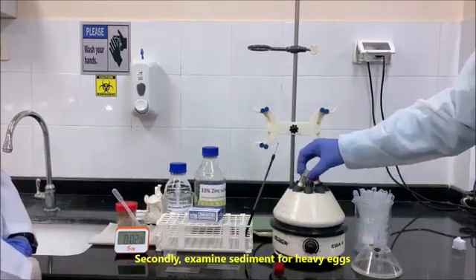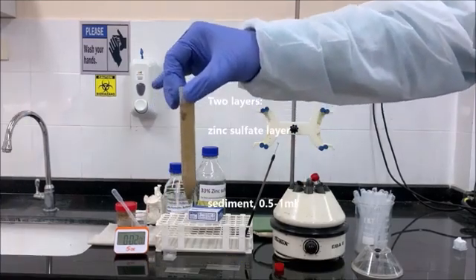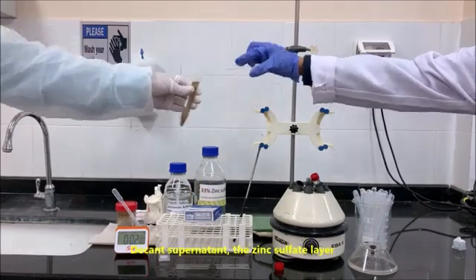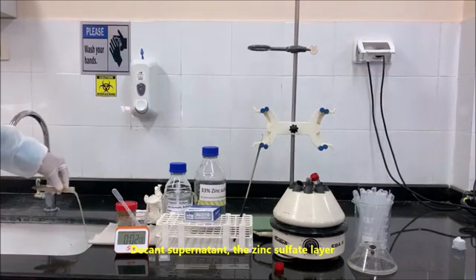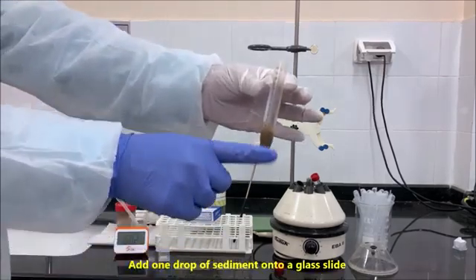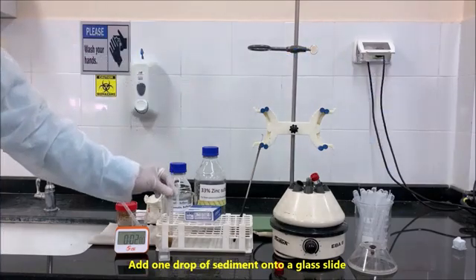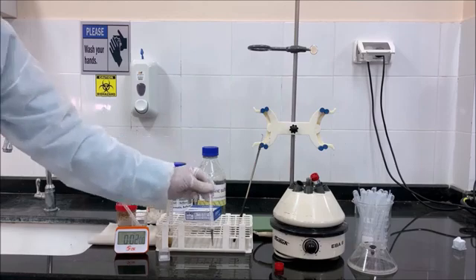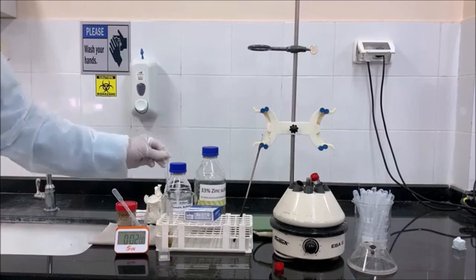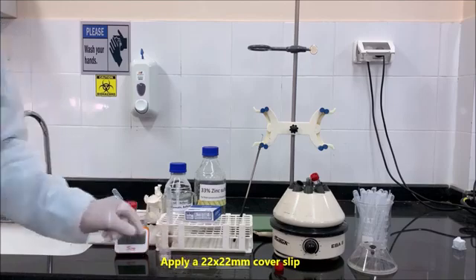Secondly, examine sediment for heavy eggs. Decant supernatant, the zinc sulfate layer. Mix well. Add 1 drop of sediment onto a glass slide. Apply a 22 x 22 mm cover slip.